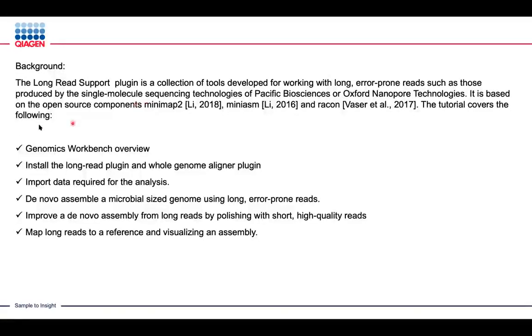So, that really got us through all of the different tools I wanted to talk about today within the long read assembly functionality. So we talked about a quick overview of the application, the lay of the land that I thought would be most useful: where the import button is, where our data is stored, where the tools are, and how we manage and install plugins. And then I showed how the long read plugin would be installed through the plugin manager, and the whole genome aligner plugin.